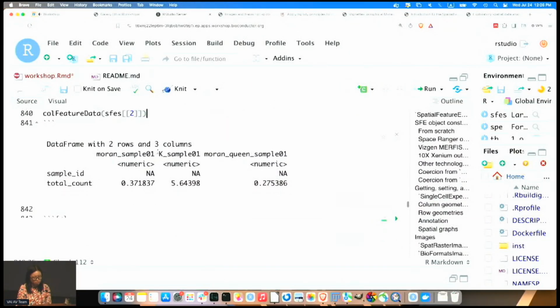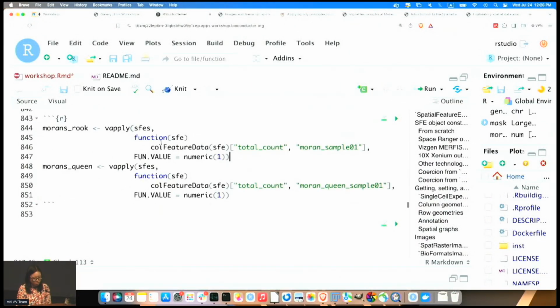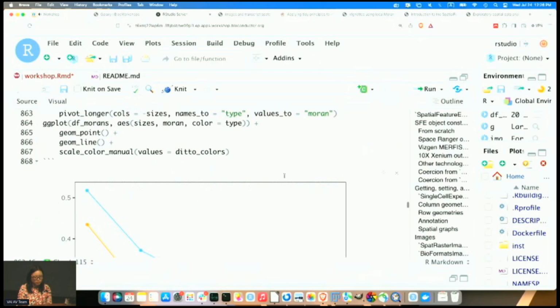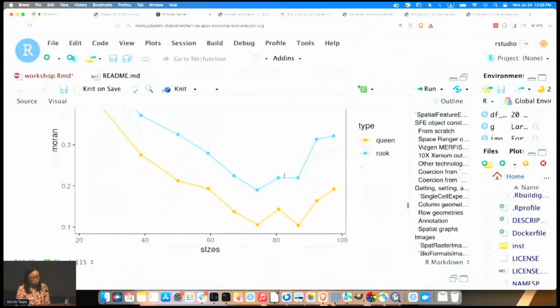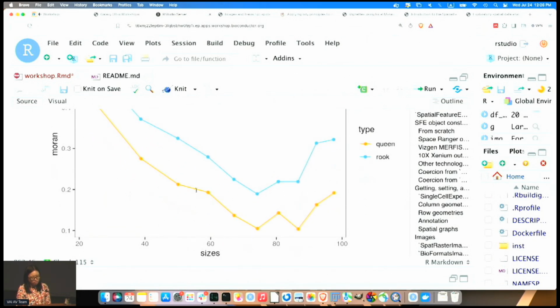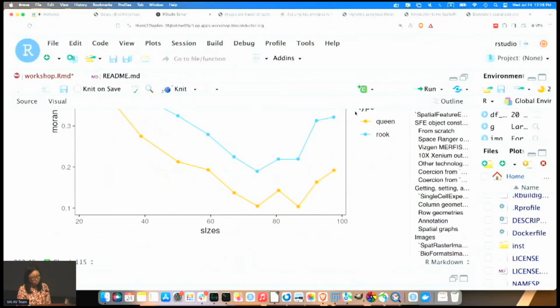Here is a bit of data wrangling to make the plot of how Moran's I varies by spatial scale. At a smaller scale it's pretty high, then it decreases for intermediate scales, but before it gets larger again for a larger scale.